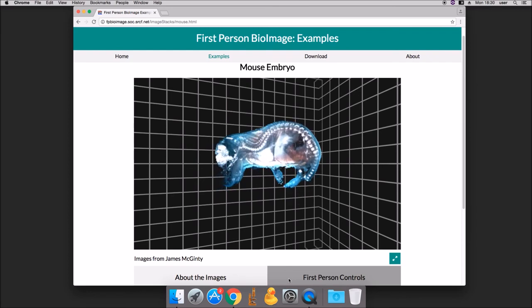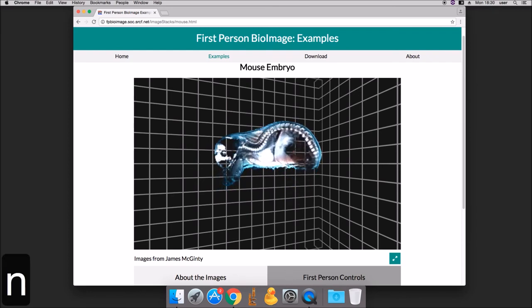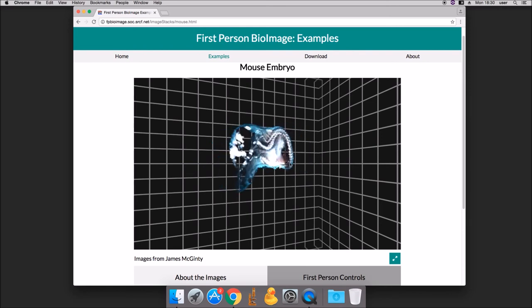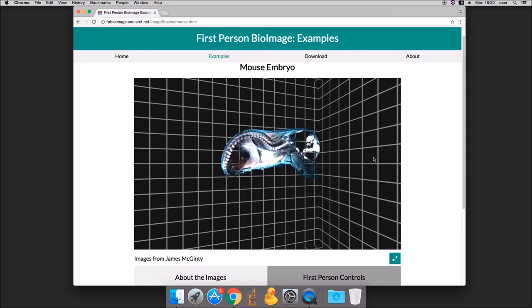Switch between cut mode and slice mode by pressing N. This will show a thin section rather than a full cut.